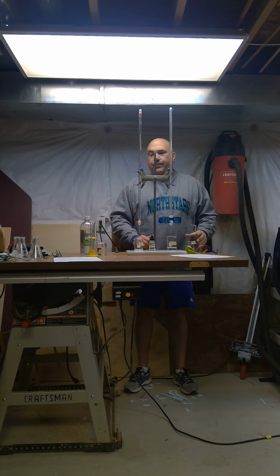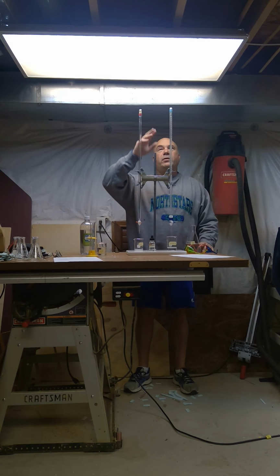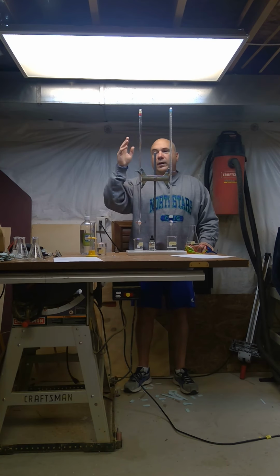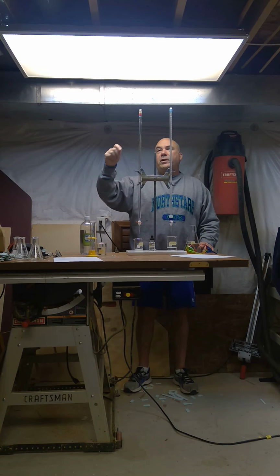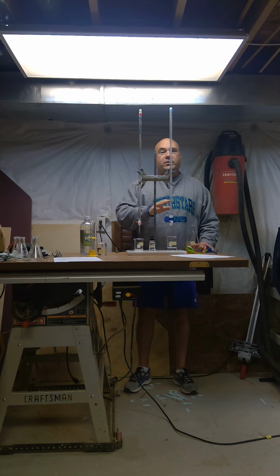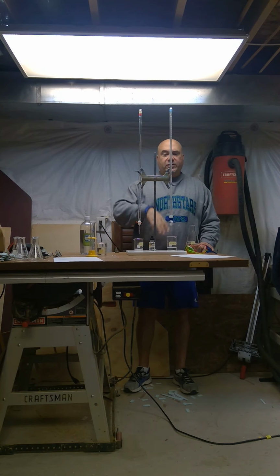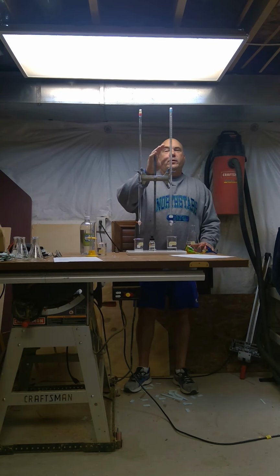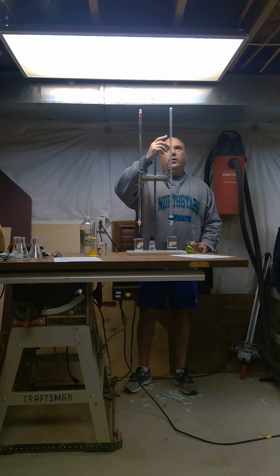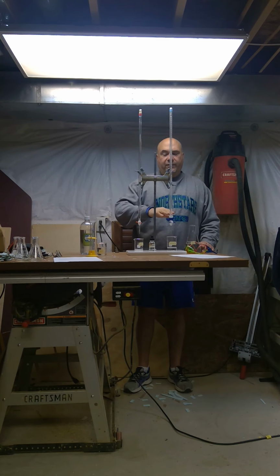Now, how you set up a titration, your burettes, is you really have to start with rinsing them with distilled water, which I did, and that just cleans them out. And then the next thing you have to do is add some of the vinegar to the burette. You have to coat the inside of the burette and drain all of that, and then you refill the burette. Same thing with the sodium hydroxide. So you start by filling it with distilled water, which flushes it out, and then you coat the inside with the sodium hydroxide that you're going to use, and then you load the burette.